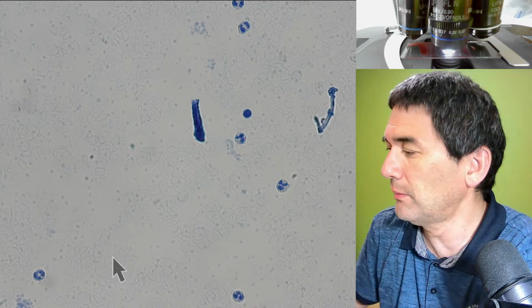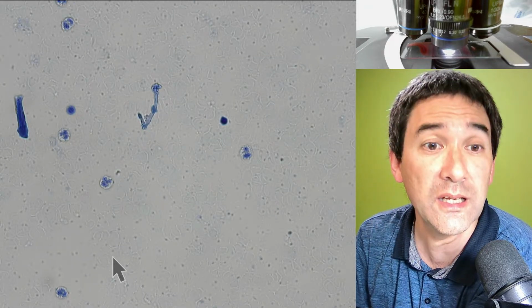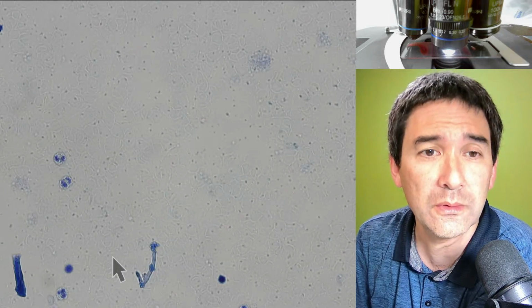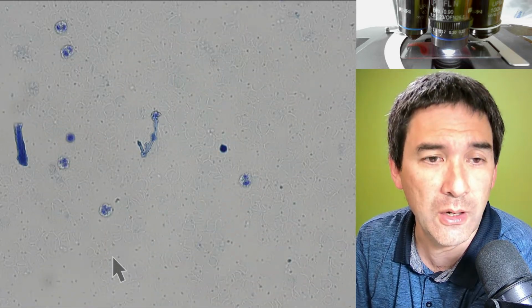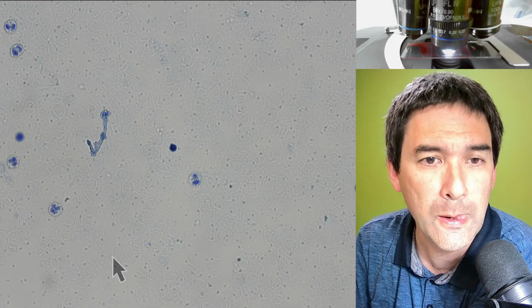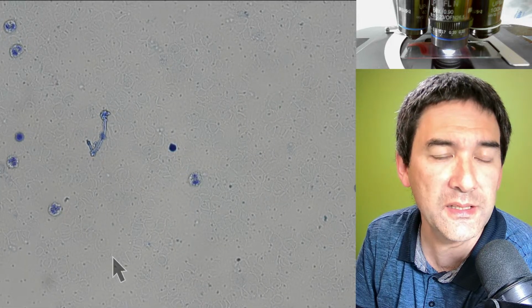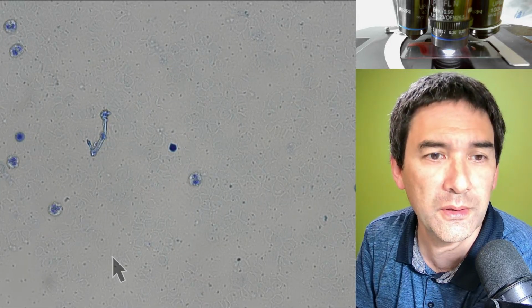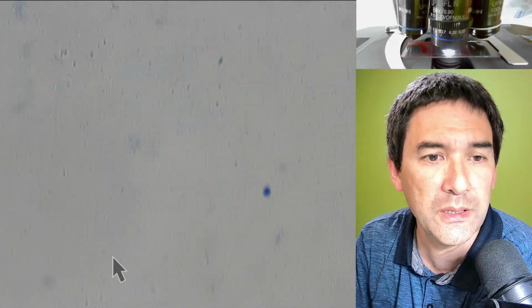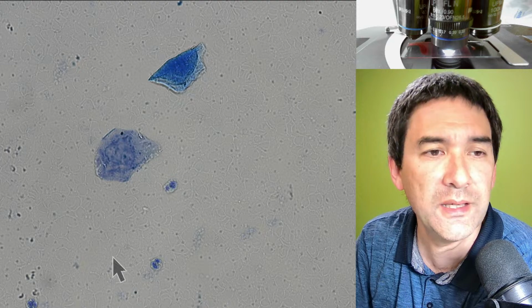So I've dried the blood. First I made a blood smear, I dried it, then I directly added some of the stain on top. And what this has done somehow, it seems that the red blood cells are not visible at all anymore. Maybe they have all lysed and broken open. But the white blood cells are still there, and their nuclei have now been stained. Those big things we ignore again.